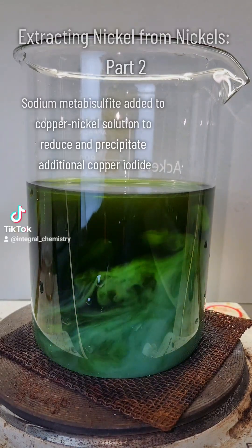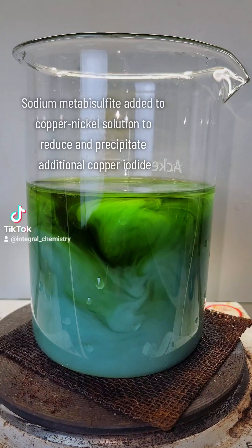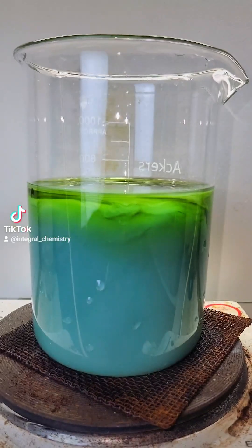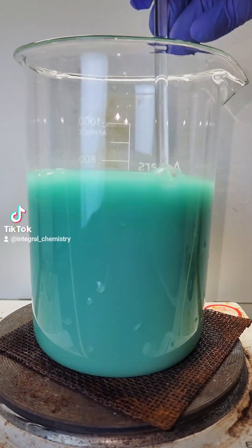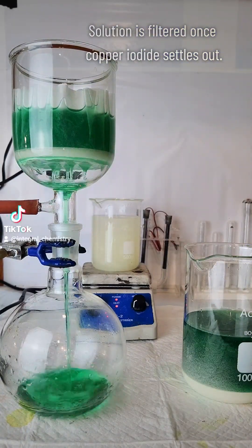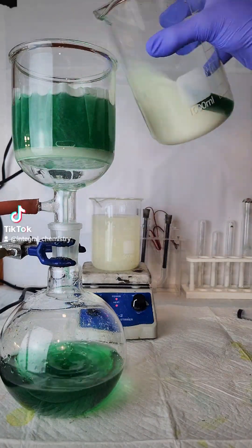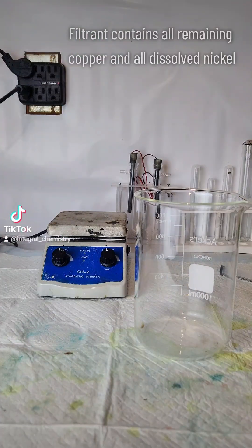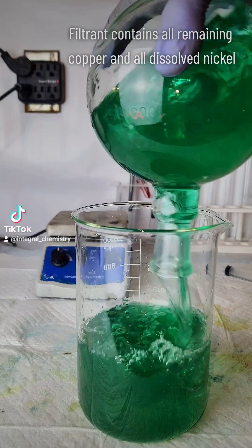Today I'm going to continue extracting nickel metal from nickel coins. I start by adding sodium metabisulfite to my copper-nickel solution. The metabisulfite is going to reduce a lot of the copper ions in solution and precipitate copper iodide that wasn't precipitated out in the previous step. I recommend watching part one first. I filter this off to collect my copper iodide and transfer the filtrate to a 1000 milliliter beaker.